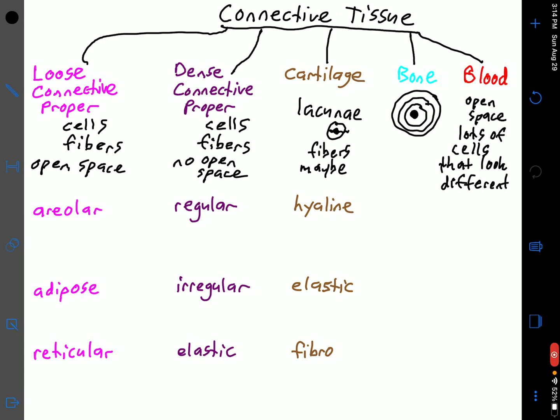In blood you're going to see erythrocytes, or red blood cells, white blood cells that might look different from one another, and a multitude of different cell types. You might even see some platelets, which are essentially just cell fragments. You can't see the fibers in blood. So bone and blood are pretty easy. Cartilage — look for the lacunae. Dense connective tissue — look for the fibers and some cells but not much open space. Loose connective tissue — look for cells, multiple different fiber sizes, and plenty of open space. Then you go down that path.